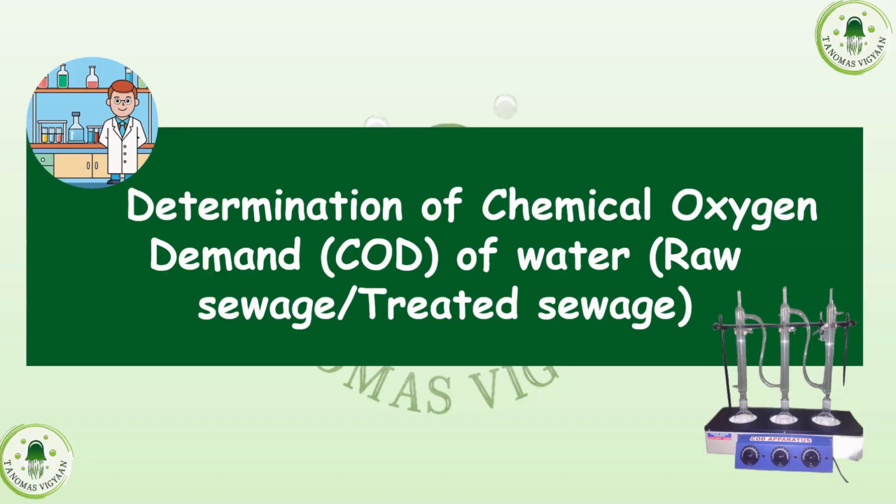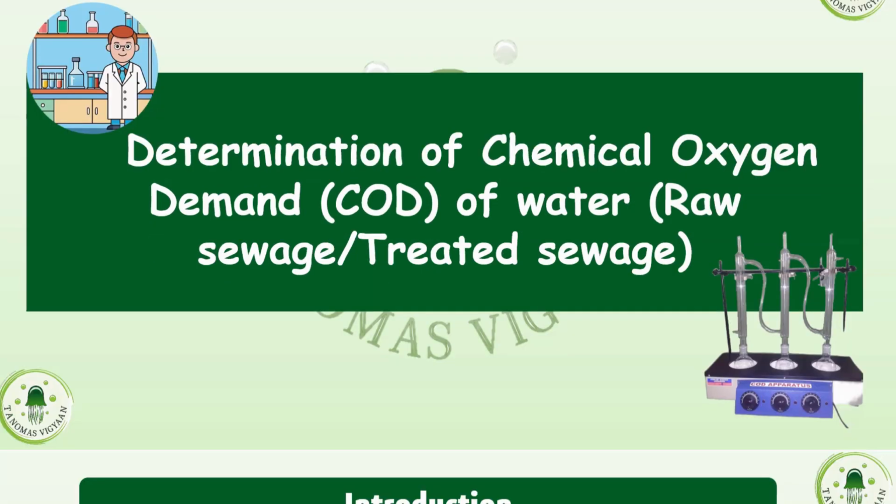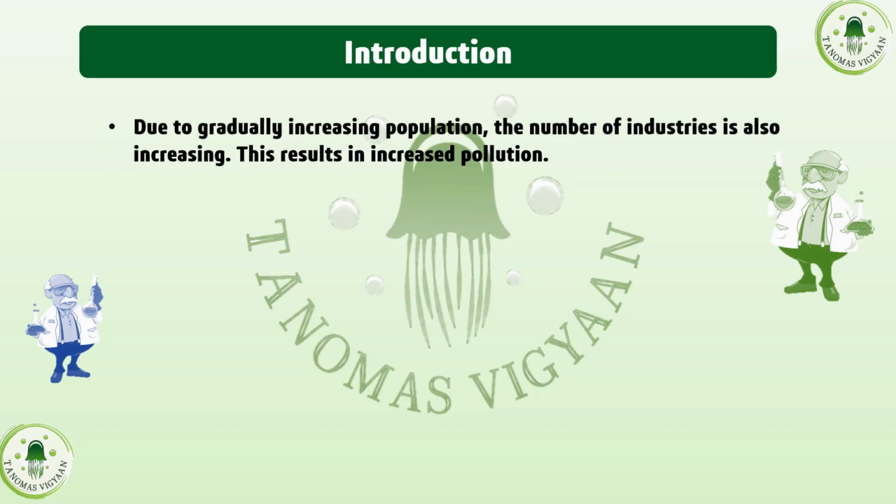Hello everyone. So today we will learn how to determine the COD, that is chemical oxygen demand, of a water sample, either a raw sewage or treated sewage water sample. Okay, so coming to the introduction.